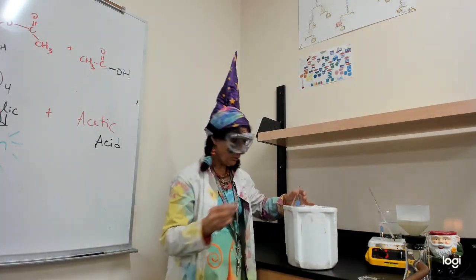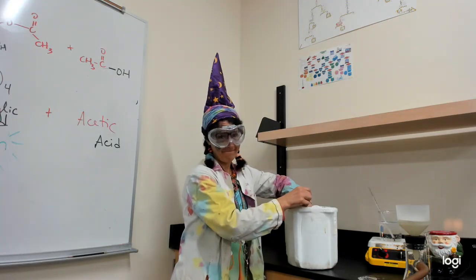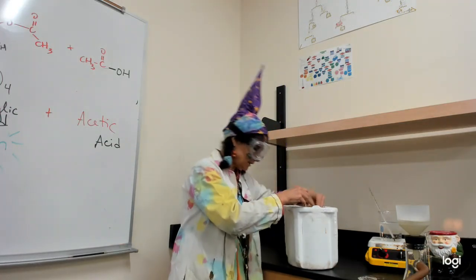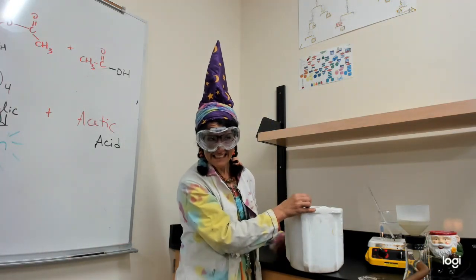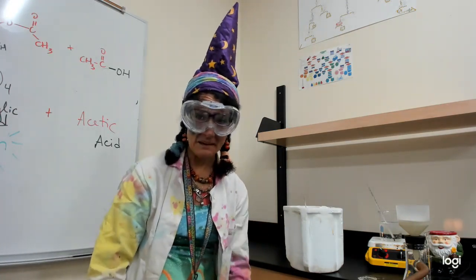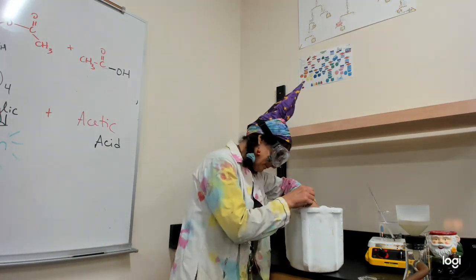Aspirin is not water soluble. There's too many carbons there. And so we just allow it to keep forming. The crystals are going to form in the ice cold water. I'm not going to show you the ice because the water here, since it's not run, it's accumulated all this gunk and it comes out brown. It's a little worrisome.